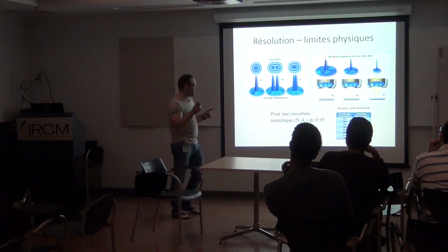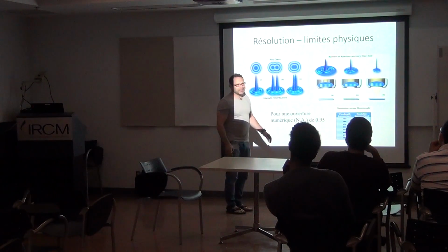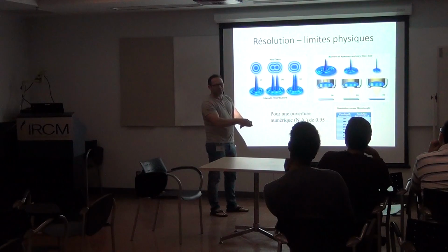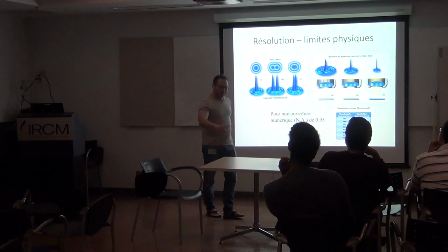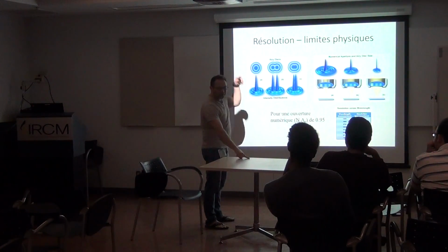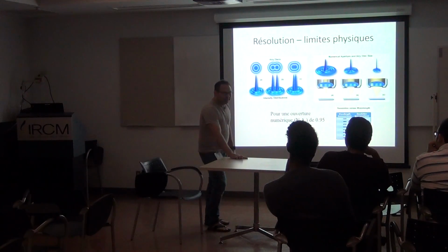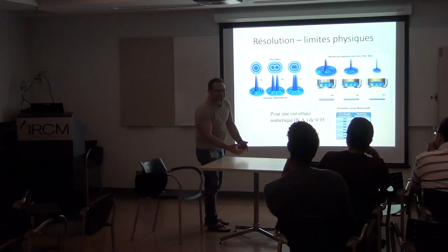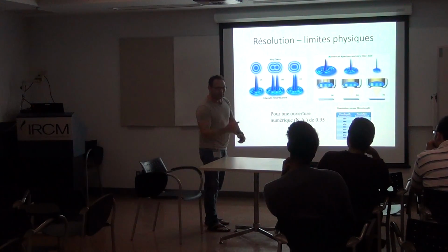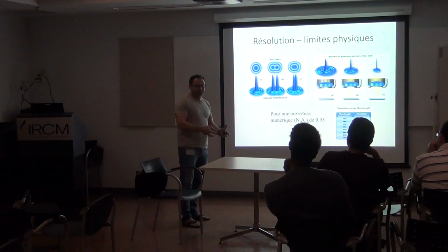But there is something: if it was the case, then every lens would be really close to the specimen and that's it. But what if you have, let's say, my finger. I want to put my finger under a lens that is, let's say, at about 1 millimeter. Then it's going to be difficult maybe to get my finger in between the system that shoots light over my finger and things like that. So it's limited by the size of the object that you're looking at.